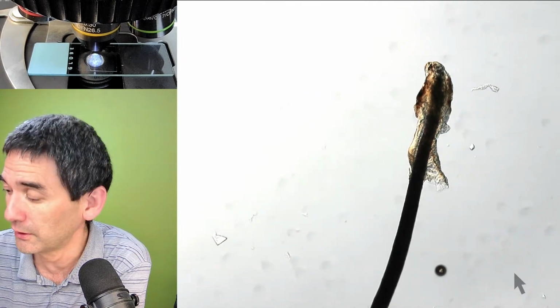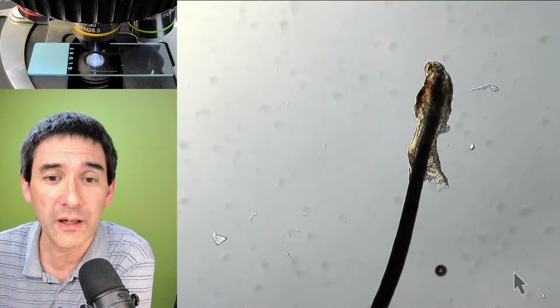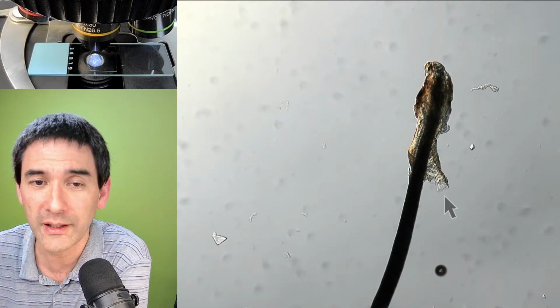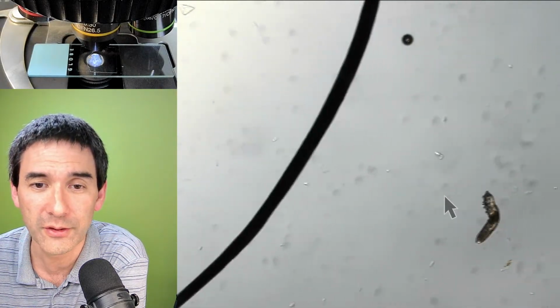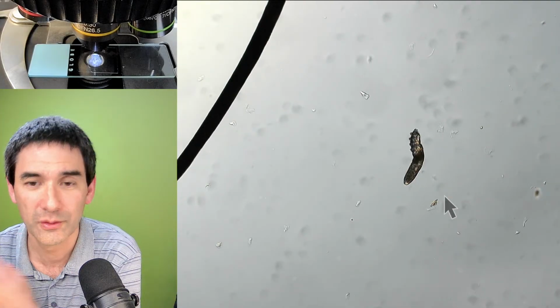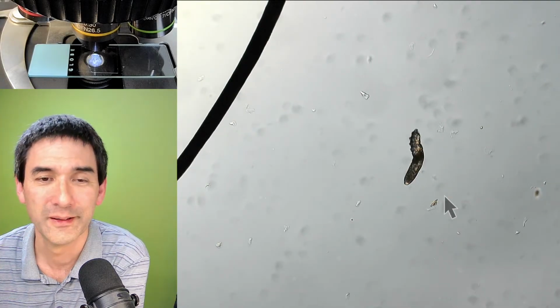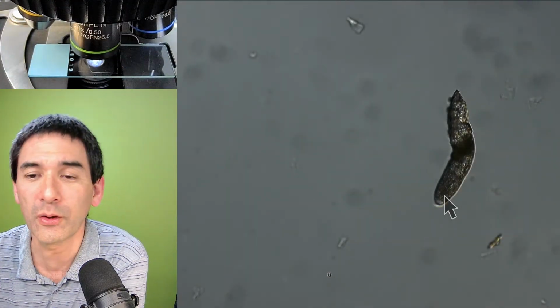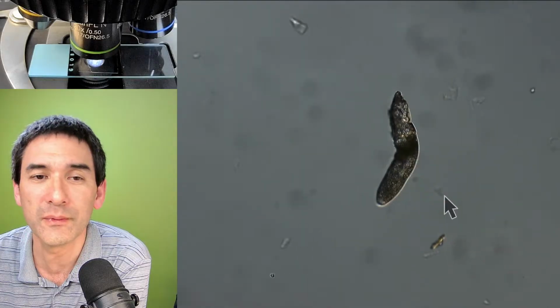That's the same hair follicle from the video, but now you see that the face mite is gone, right? And where can you find it? Down here. Okay, yeah, so it was able to crawl out. So just a little bit of a before and after.